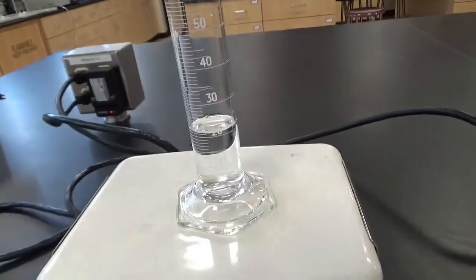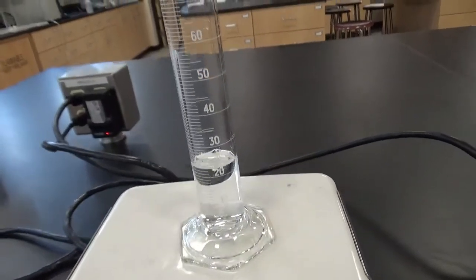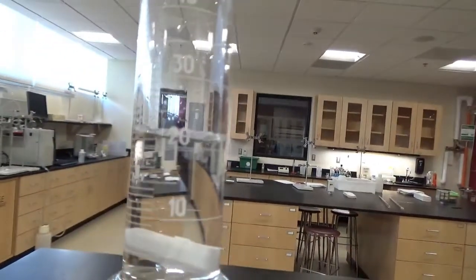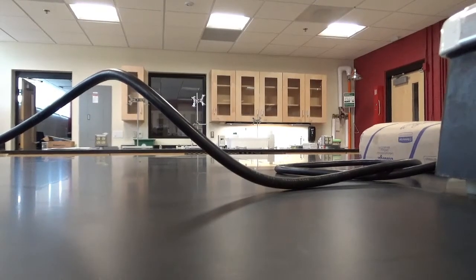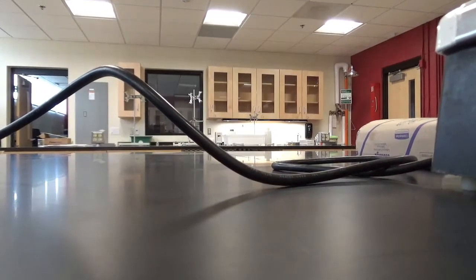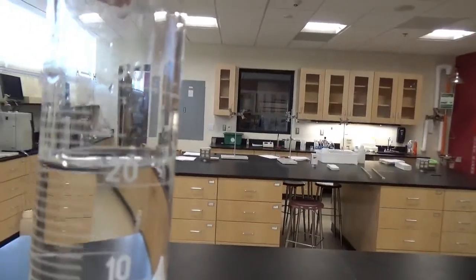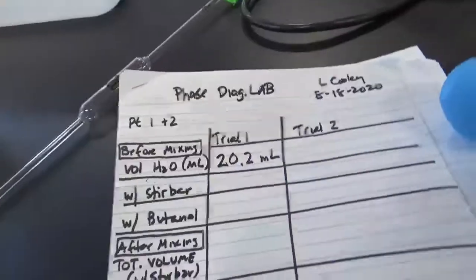I'm going to dump it right in. Not very graceful. And now I have to measure the volume again, which I'm going to do away from the camera. I would say it's 21.3. It's hard to tell here, but that's what I read.